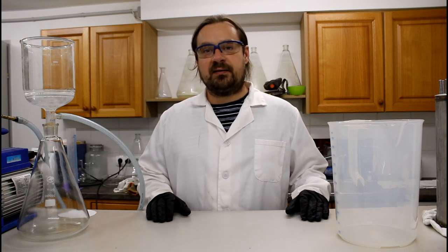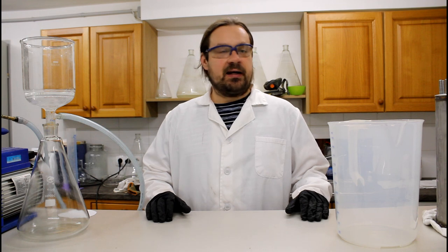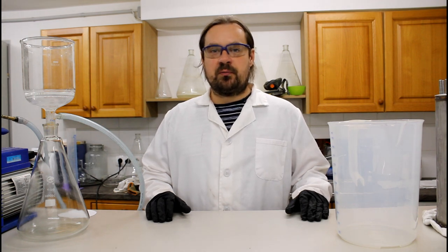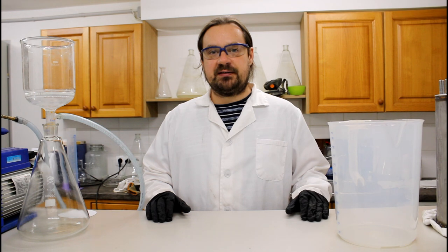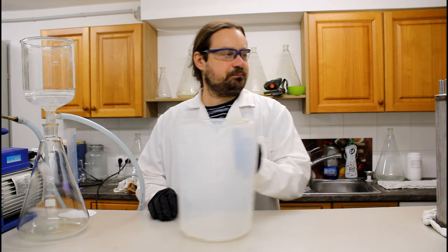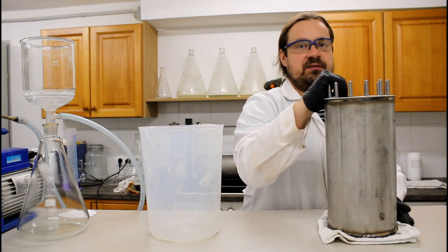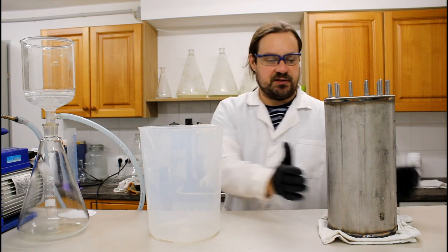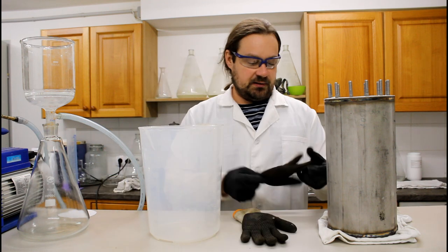So we have boiled our ore about 24 hours in the concentrated sodium hydroxide solution, and the next step that we are going to perform is filtration, and after the filtration we are going to precipitate the metals out of it. Okay, so let's start. It's still quite hot, actually it's very hot, so I have to use a second pair of gloves because I don't want to burn my fingers. Okay.